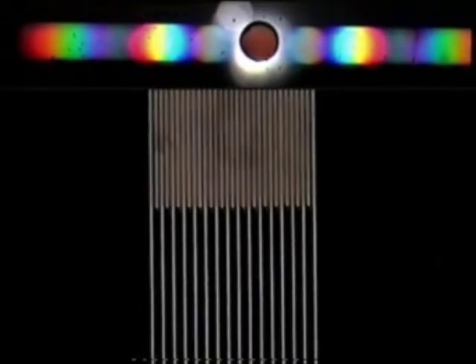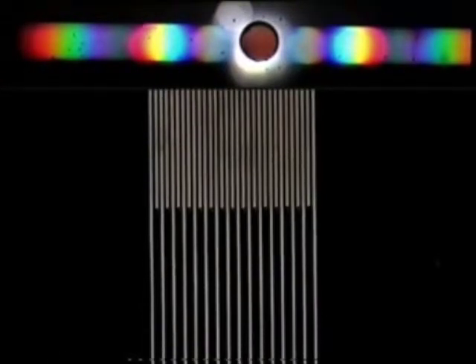There you see the effect. The lines are now bright, the background is black.